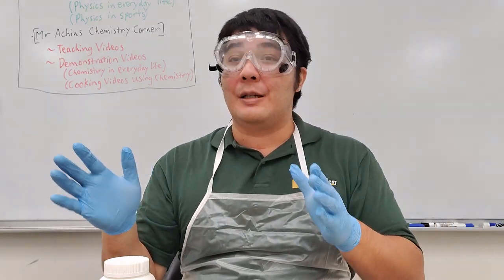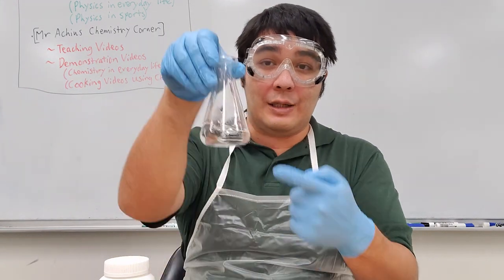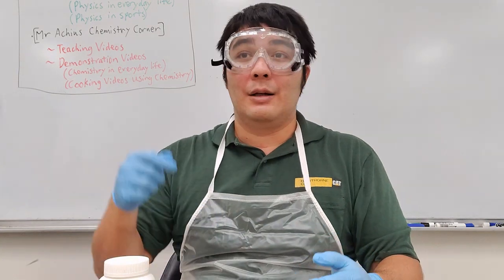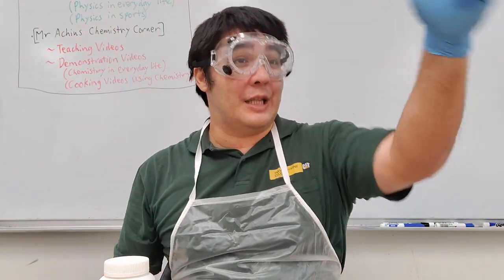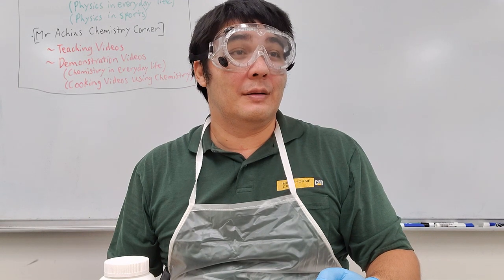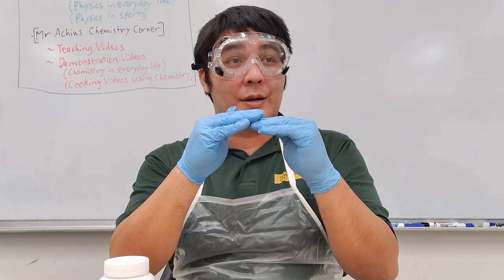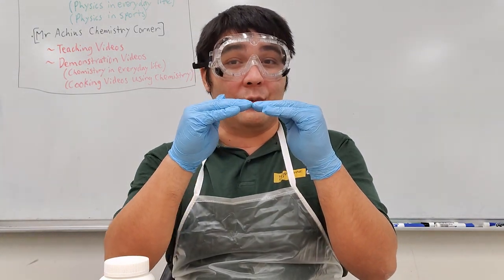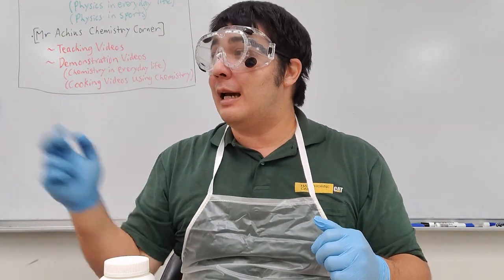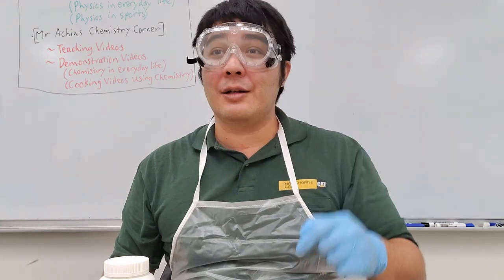What do you think is going to happen when I put the Drano into this beaker of water? Okay, it'll change color, it'll separate. What does that mean? Some sort of element is going to come in the water while something sits on top. Oh, okay, so some elements are going to separate, one's going to float, one's going to sink? Yeah. Okay, that sounds good. Any other ideas, other hypotheses? Yes? The temperature is going to rise. The temperature's going to rise? Okay, sounds good.